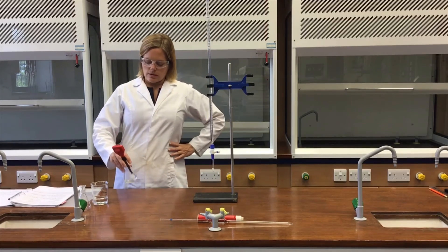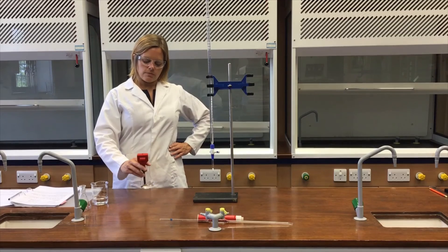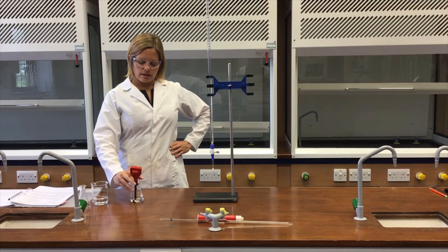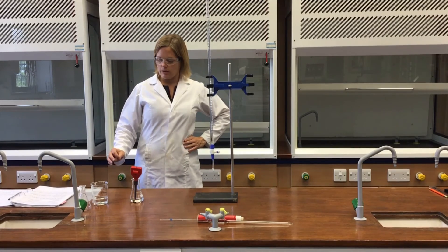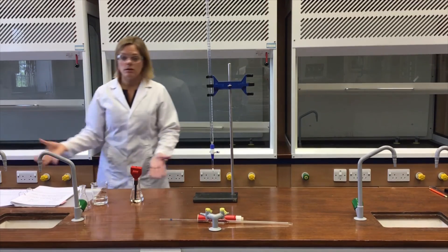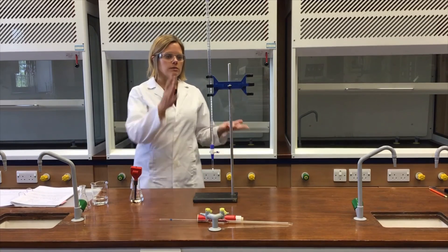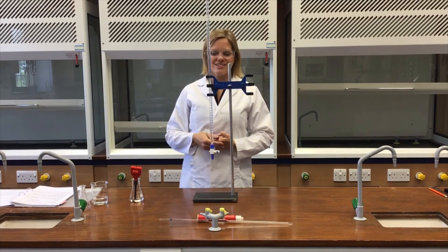Give that a little swirl to mix it thoroughly, then pop the pH meter in. Make sure it's completely mixed and let the reading settle. That's now at 9.39, so I'll record that down. I will continue to add those portions until a total of 20.00 cm³ of HCl has been added from the burette into the flask.